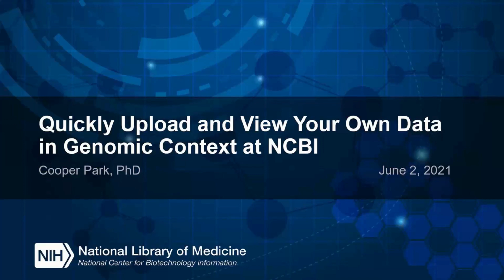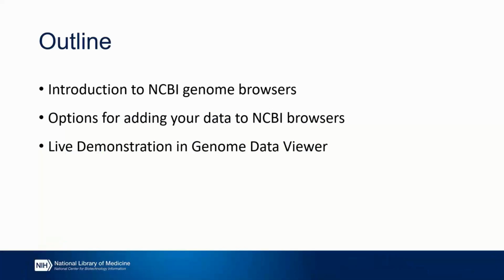Awesome. Thanks, Peter. As you've already heard, and you probably already knew from registering today, the talk today is about uploading and viewing your data in genomic context with NCBI and our data viewers. So here's just a brief overview of what we'll be covering today.